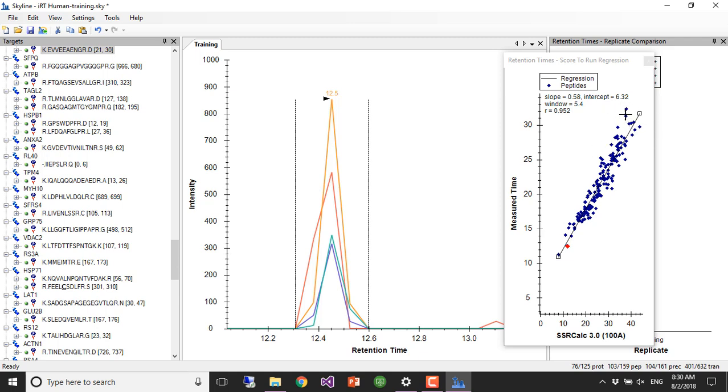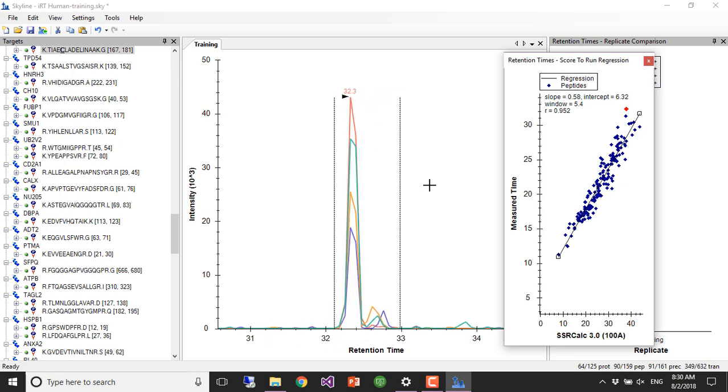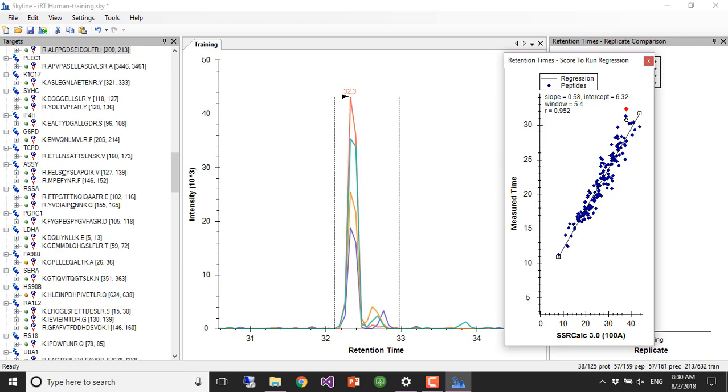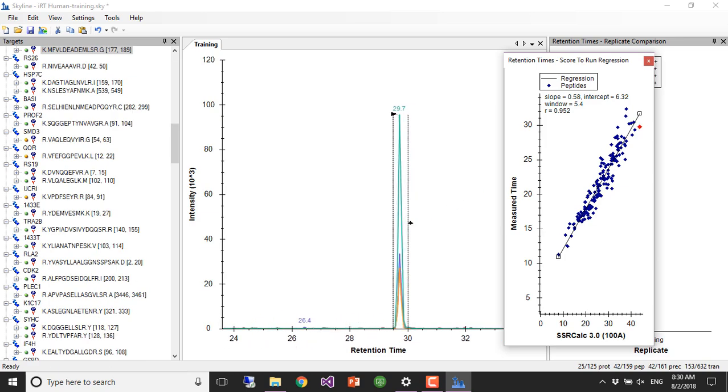And then we might also look at a few of these way up at the far end, but probably those are not going to yield anything. Like, yeah, that's probably the right peak. And that's probably the right peak. So anyway, we corrected 2 peaks.